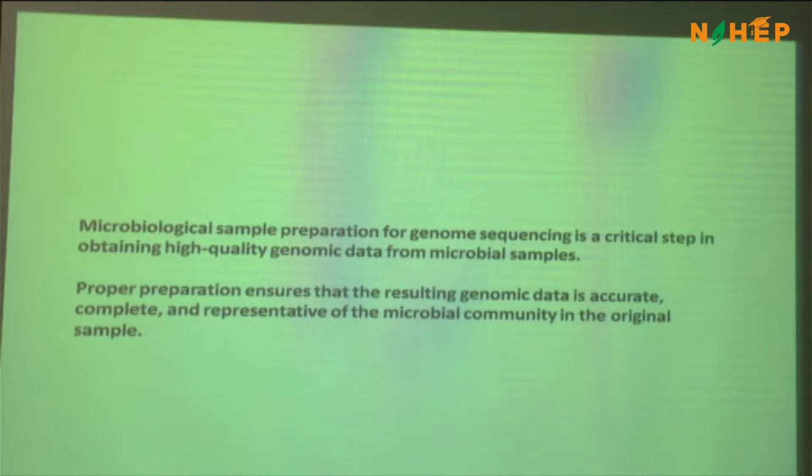Yeah, just have a reading. The proper preparation ensures that the result of the genomic data, which also includes the so-called microbial metagenomic data, I think this is explained in the manual. Please go through that. Is accurate, complete, and representative of the microbial community in the original sample.